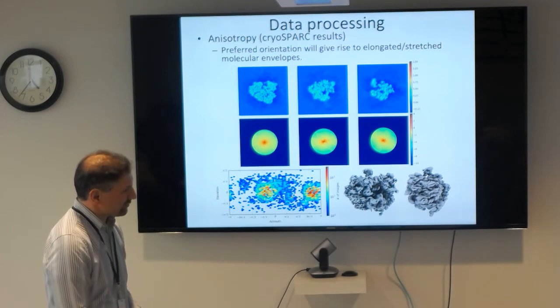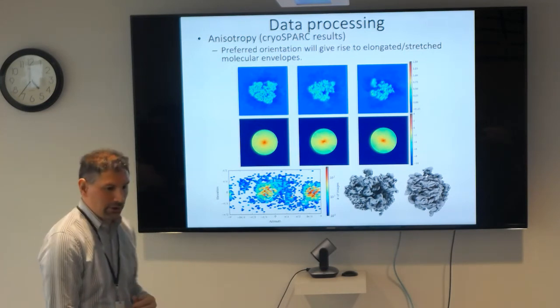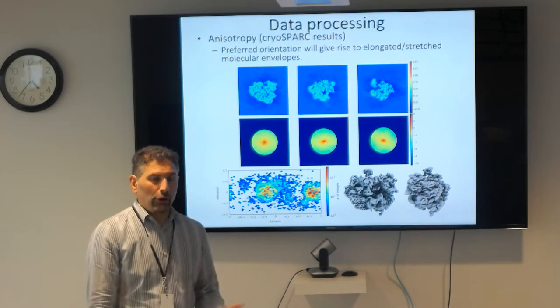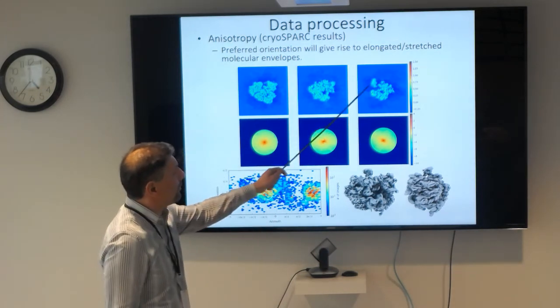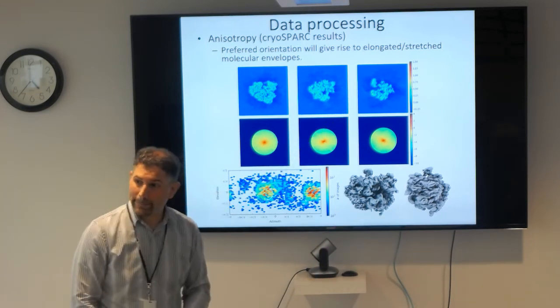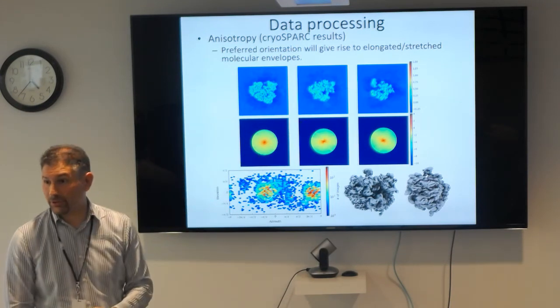And if it's a local feature, it could be flopping around. So this would, for example, be a flopping around kind of region. If I were to just look at that, I would say it just looks like a flexible domain or something. So you could put a mask on that and see how it does. Do the focus classification on that.